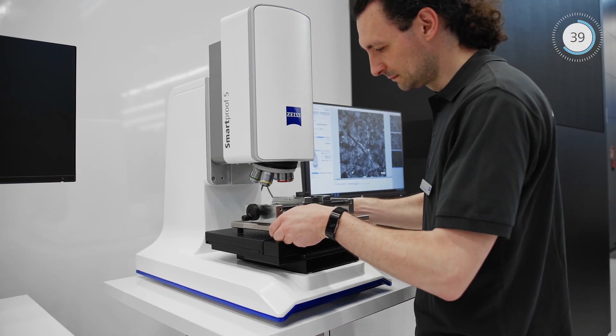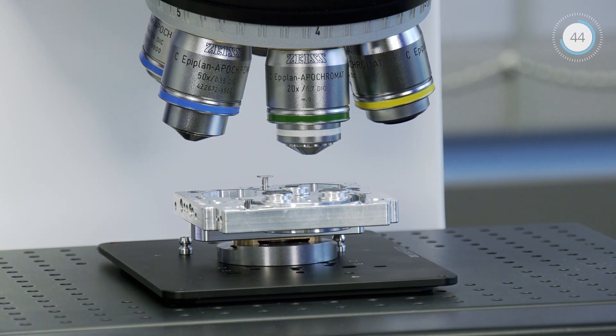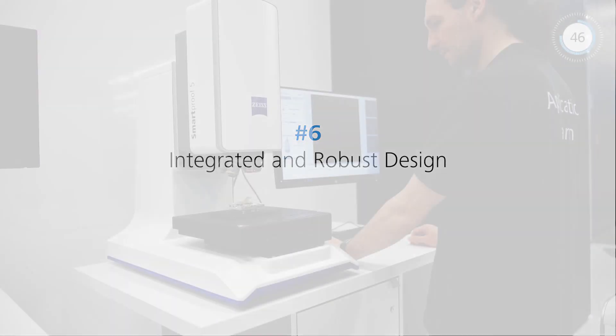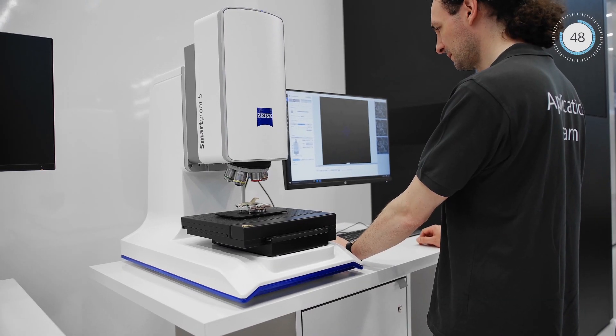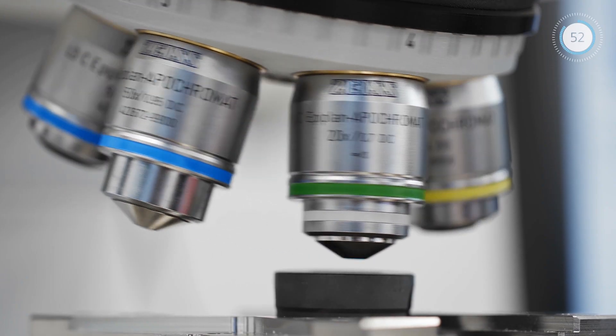Load the stage with large and heavy samples or multiple holders and fixtures for greater productivity. The robust and fully integrated design minimizes vibrations to enable use on the shop floor.